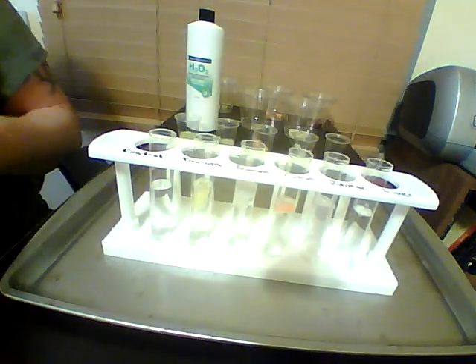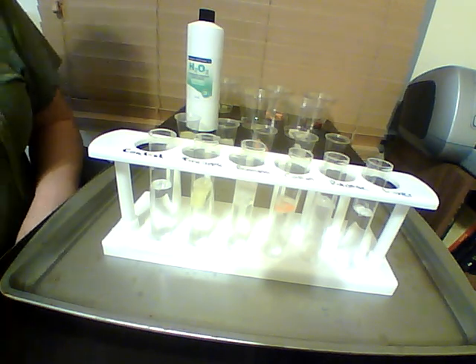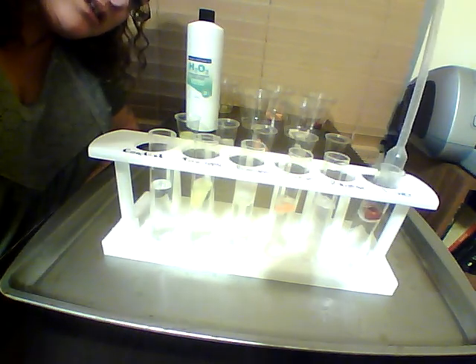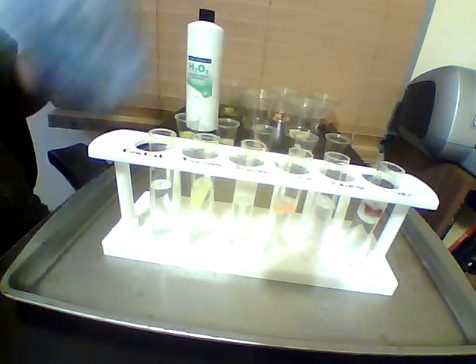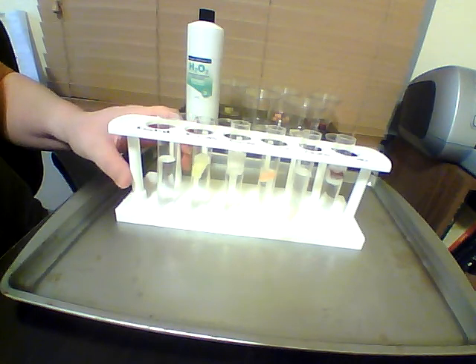Okay, so hopefully you can see these. I am going to push this liver down in here a little bit so it actually hits the hydrogen peroxide. And hopefully you can see that we have a pretty dramatic reaction going on.